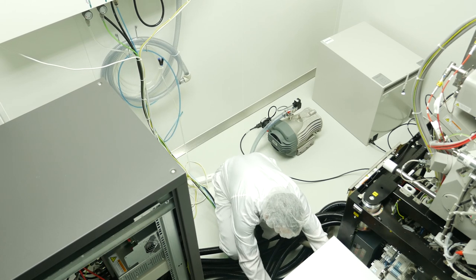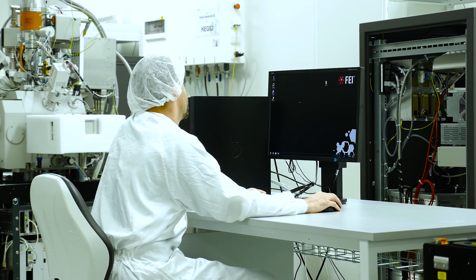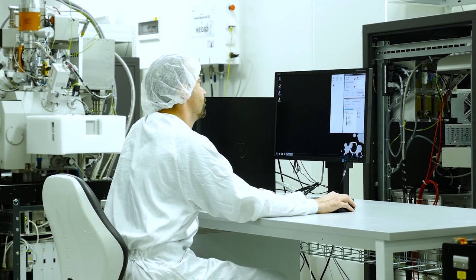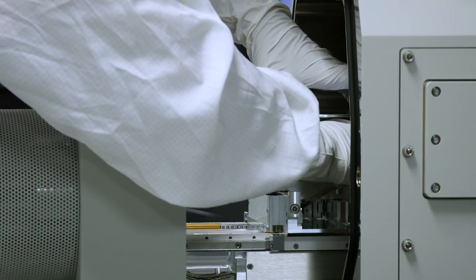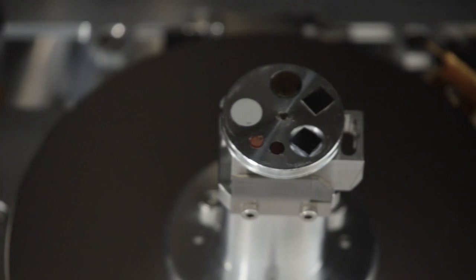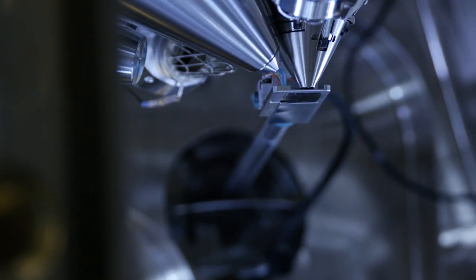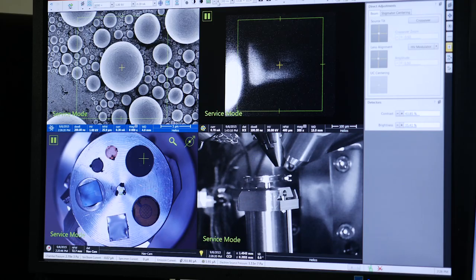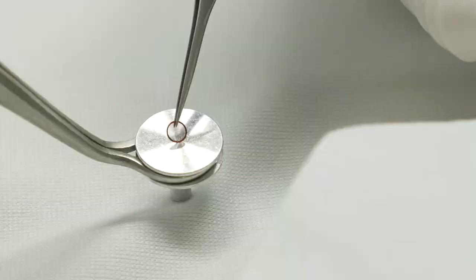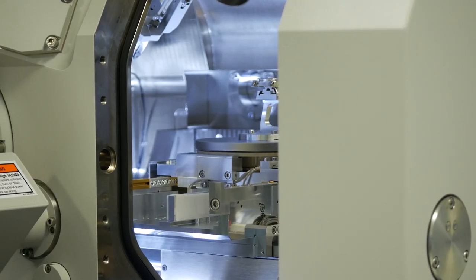First, the finalization specialist interconnects all the electronic boards with the server where they install the microscope software. The testing sample is inserted into the microscope. During the microscope setup and testing, several standardized samples are used, including tin balls on carbon, a silicon chip, TEM grid, platinum target, gold grains on carbon, and so on.